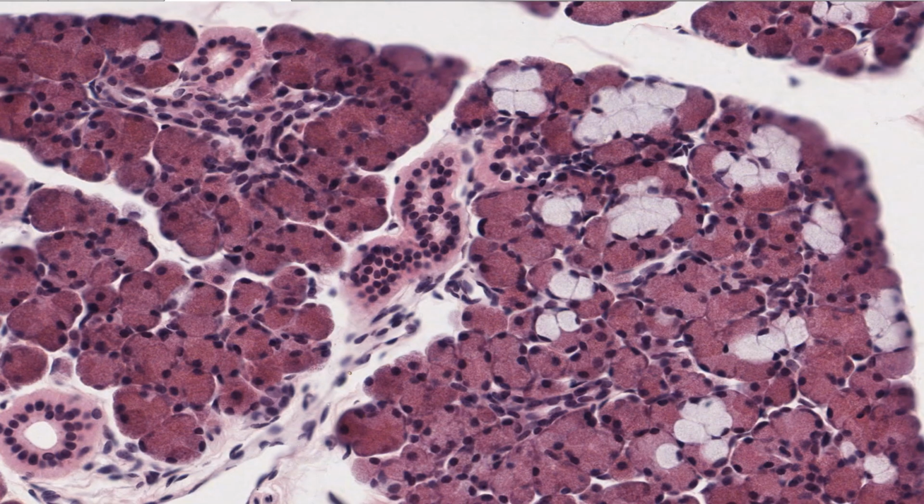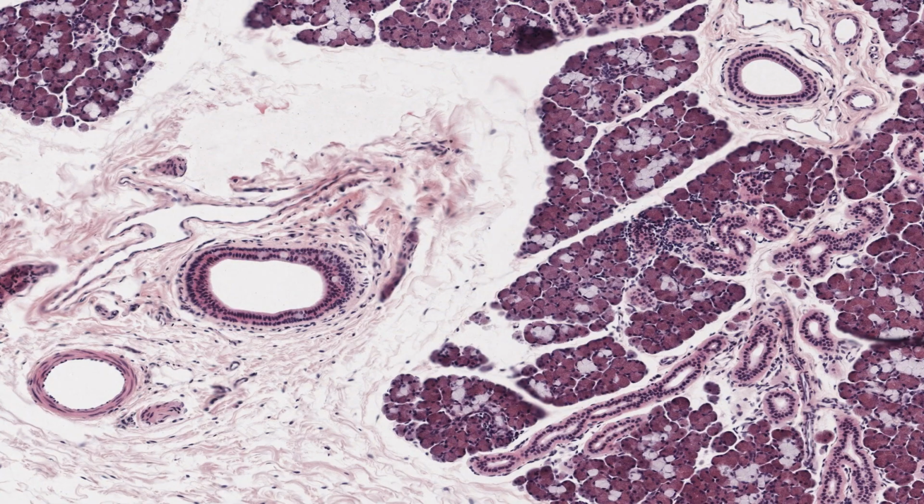The submandibular gland has both striated and intercalated ducts, although most of the intralobular duct system is made up of the striated variety. Short segments of intercalated ducts run into the striated ducts. The large number of obvious ducts is one way to distinguish sections of the submandibular gland from other compound glands of the body.